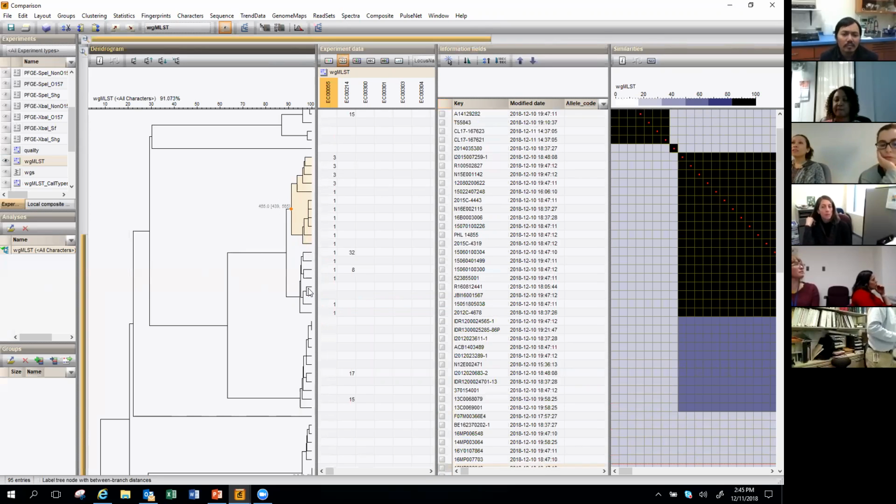But then you might want to know, well, how does group 3 compare to group 1? You can't really do that with this labeler, because you can click this node, but it's going to include all of these together, not just this one compared to this one. So we have worked with Applied Math to develop a way to do that, and that's through using grouping.